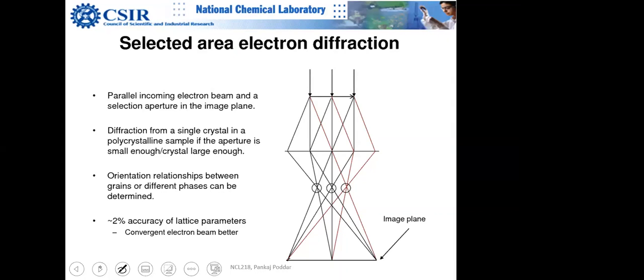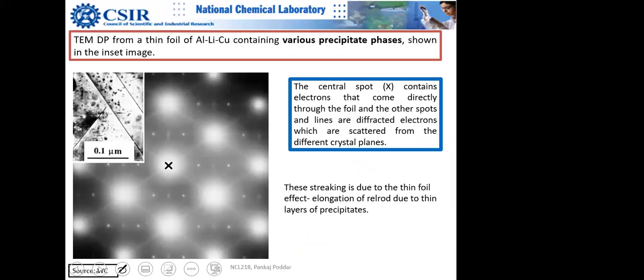So this is a typical electron diffraction image. It looks fairly complex. This is basically in reciprocal lattice space. That's why I told you first you have to understand the reciprocal lattice. You have to understand the real lattice first, and people don't understand even the real lattice. Then you have to understand the reciprocal lattice, so these dimensions are all inverted: 1 over angstrom or 1 over nanometer. So these distances can give you an idea about 1 over d.